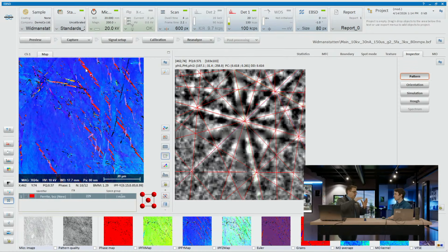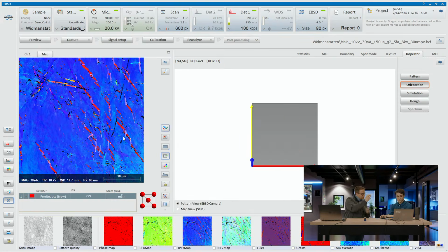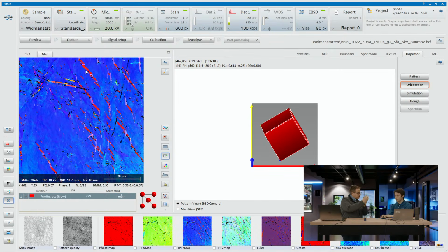So the overall confirmation, or the overall structure that tells us the orientation of the crystal is at 101, 110, things like that. Yeah. And as you moved it around subtly, the pattern moves a little. And that means the crystallites are moving a little bit. Yeah. Okay, so what are we looking at here now?